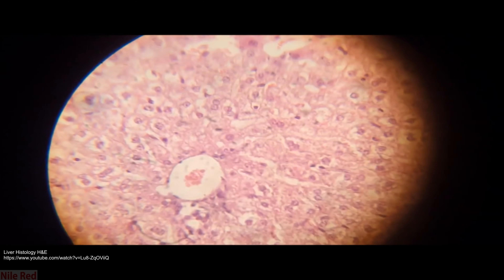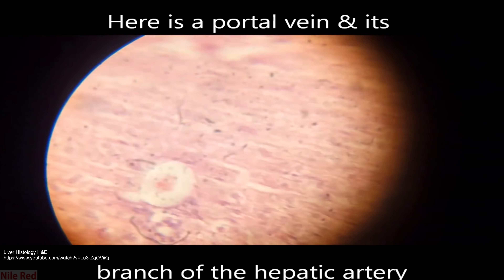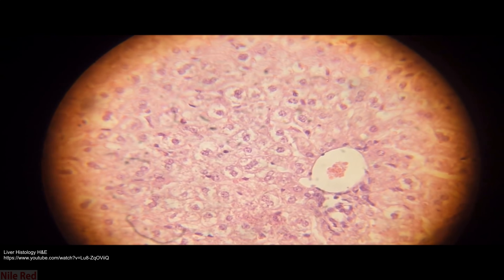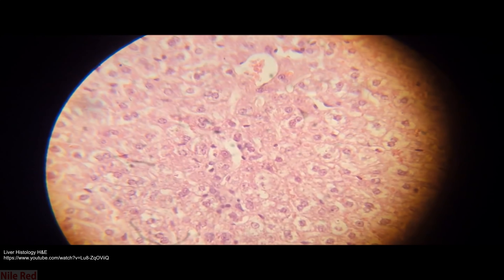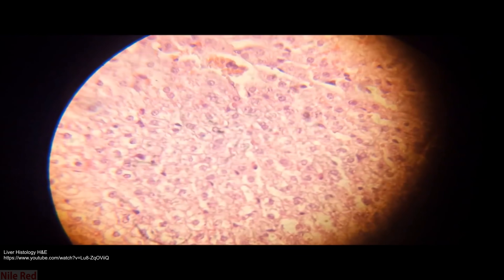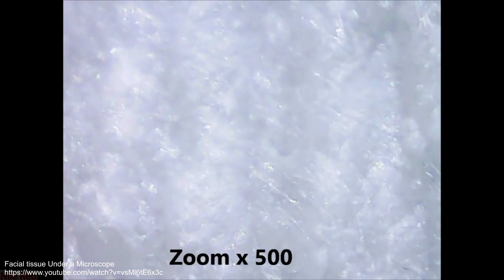Now we can look at some tissue that has been stained using H&E — unfortunately this is the best quality footage I could find. You can see that the nucleus of each cell, which contains all of the genetic material, has been dyed blue by the hematoxylin, and the rest of the cell has been dyed red. The key takeaway is that cells are generally colorless and don't have much contrast, so without the dyes it would be really hard to tell what's going on.